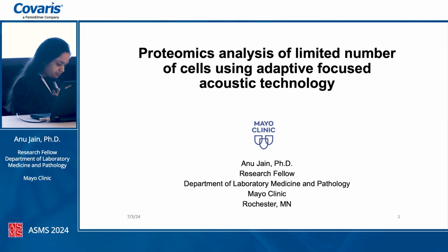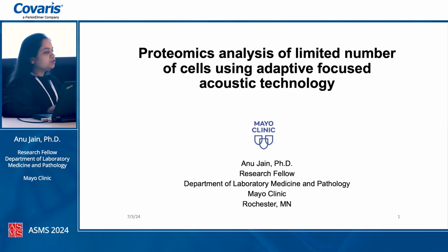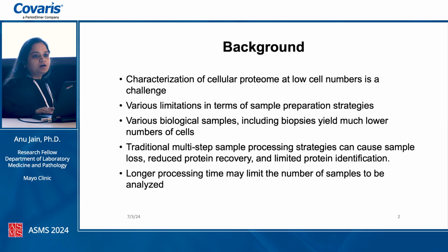Good morning all. So I'm going to present the data from proteomic analysis of limited number of cells using adaptive focus acoustic technology. So we are at the mass spec conference, and we all know that with the current generation of mass spec, proteome analysis even at the single cell level is feasible.